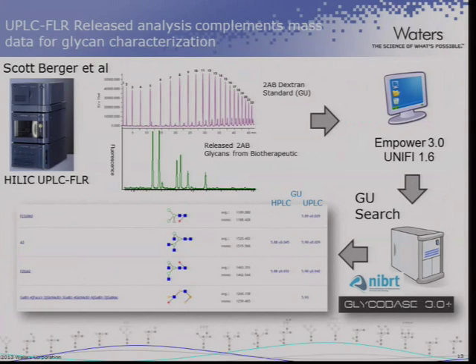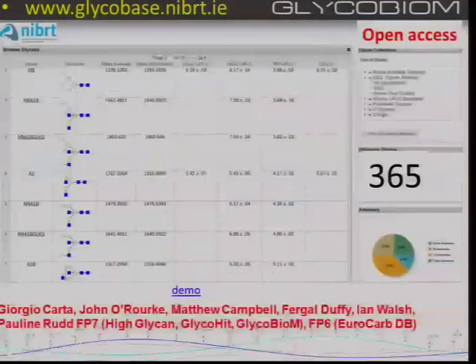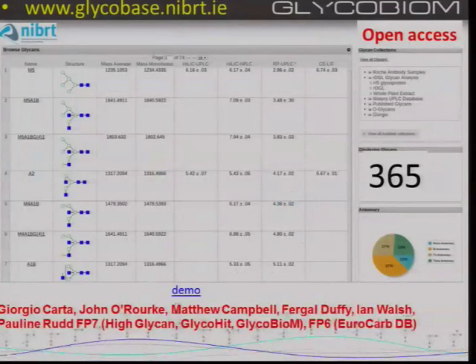Okay. And depending on the nature or the principle of separation, for example, capillary electrophoresis and HPLC, is there any difference? I'll show you some data. There is some difference, yes, but I'll show you how you can overcome that. But if I can talk to the slide, it's easier if I show you the data.